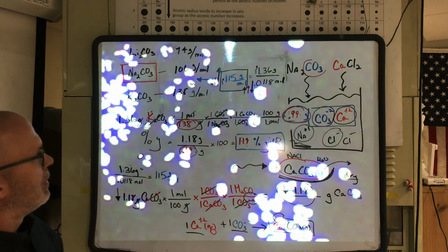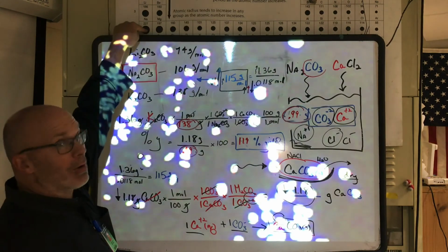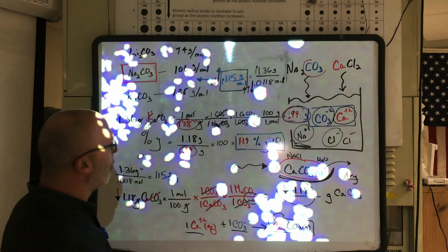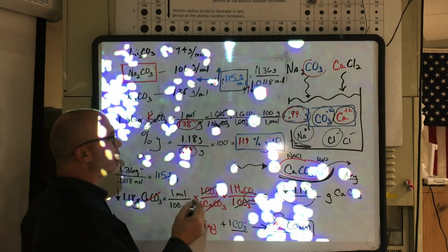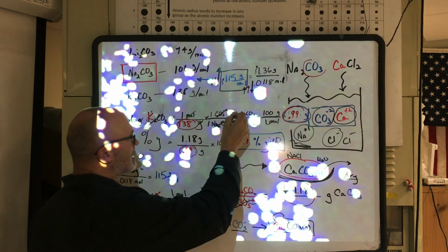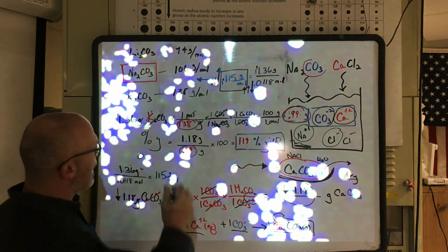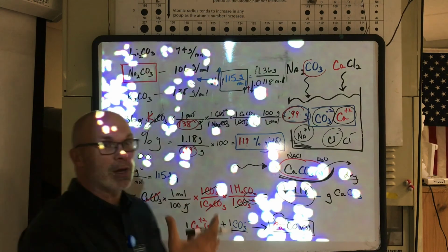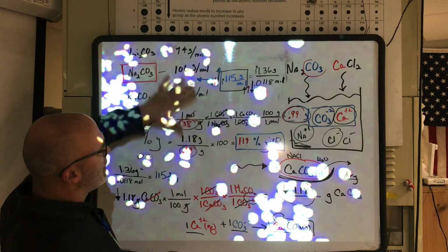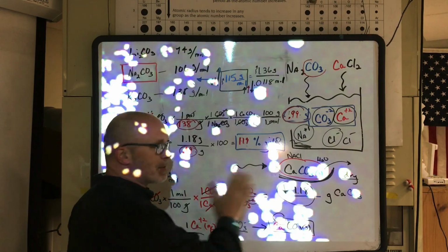And you may say, well, why possibly? Well, maybe it's because the potassium is a much, much bigger ion than the sodium. So you can actually open these up and pour to see what you had, which is pretty cool to look at. We were looking at the gravimetric analysis, but we can also look at the size of the crystals that give us some hints about what we had. So in sample A, we had these smaller crystals, made of sodium ions and carbonate ions, and these sodium ions are smaller, and that may have led to the smaller and finer salt crystals here than the larger ones here that are made of the potassium. Kind of cool, I think.